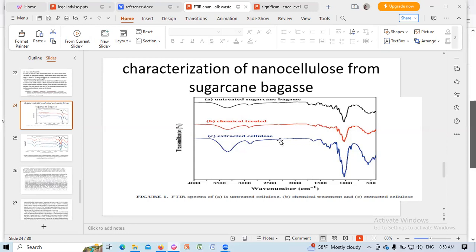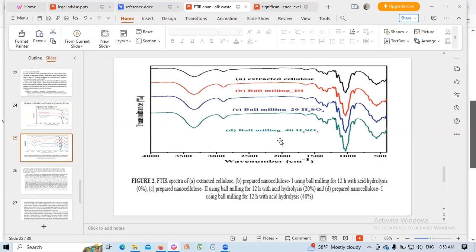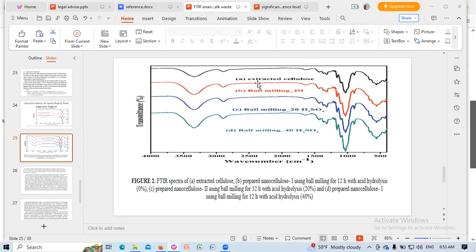Similarly, in the nanocellulose, all similar peaks are present. This is the nanocellulose extracted from cellulose using ball milling and sulfuric acid.